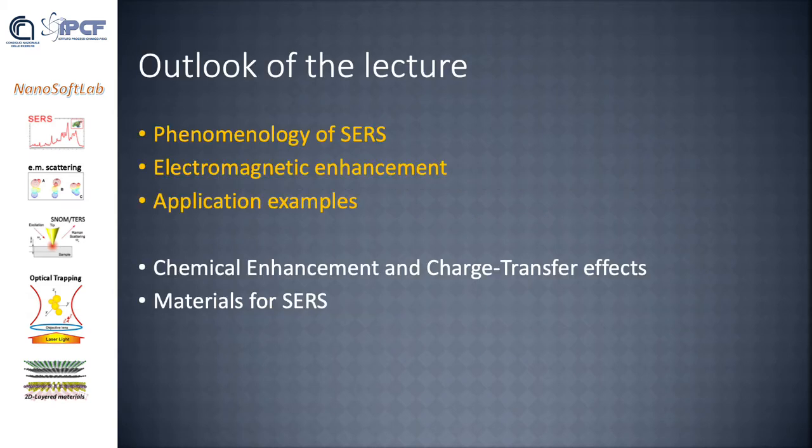In the first part of the lecture, we will discuss the phenomenology of SERS and the basic enhancement mechanisms, and we will focus our attention on the electromagnetic enhancement process that provides the largest amplification. Then we will see some other application examples.